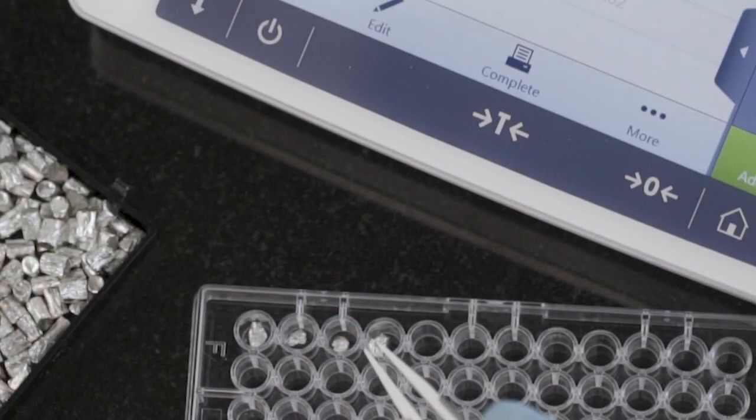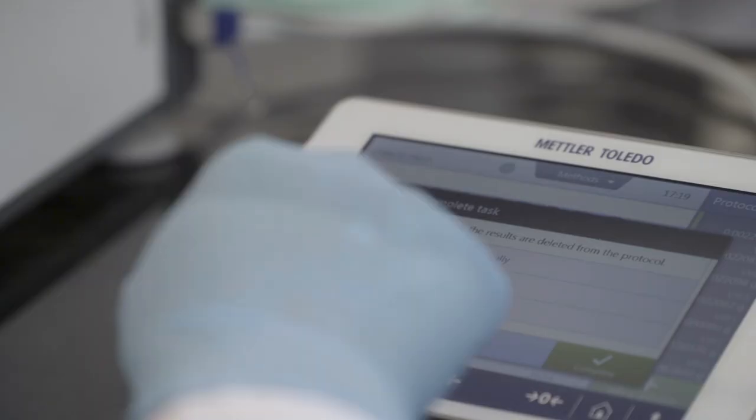Each crucible is carefully sealed using fine tweezers and placed in an appropriate tray for clear identification. Once all the samples are prepared, the weight results can be printed or exported to a computer or USB stick.